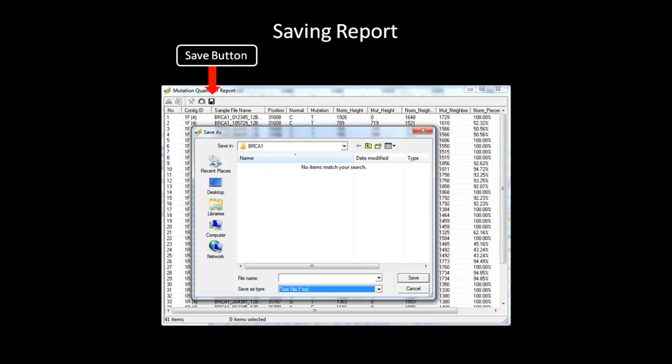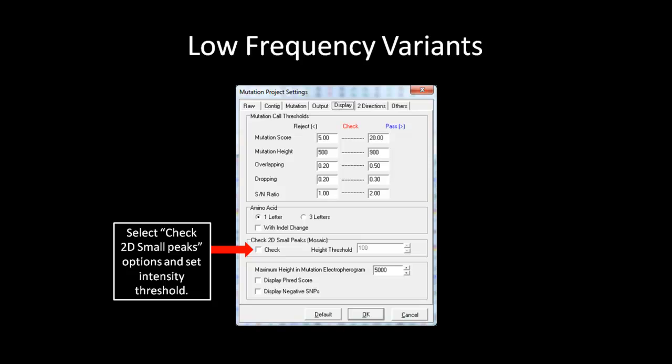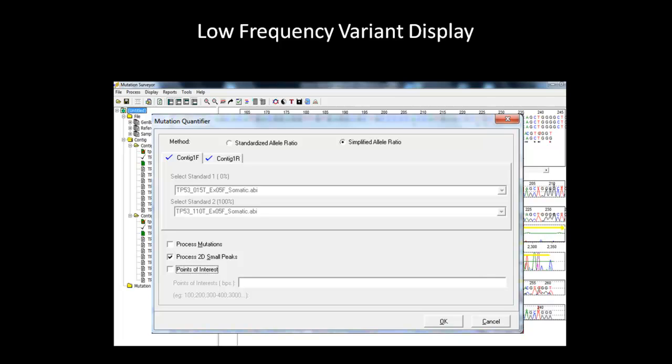Now that we have discussed the standardized and simplified allele ratio, we will now move on to discuss quantifying low-frequency variants such as somatic mutation, mosaicism, or heteroplasmy. In order to quantify low-frequency variation, you must have selected the Check 2D Small Peaks option and set the threshold for the peak intensity. Usually 200 is a good number, but optimal settings will depend on the data set. You can try different thresholds to see what is best for your data. The green horizontal bars indicate positions that could possibly have low-frequency variants, detected by checking for minor peaks under the major peaks greater than a set threshold with the same color in both the forward and reverse direction. For more information regarding low-frequency variants, please refer to the specific webinar.